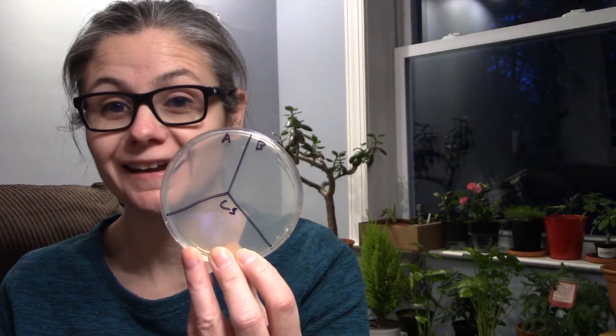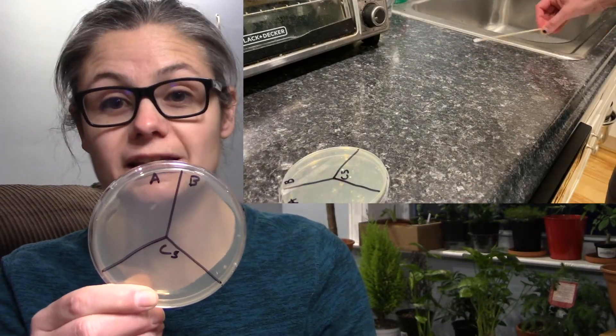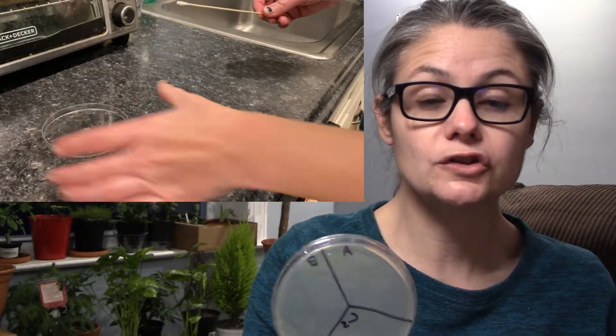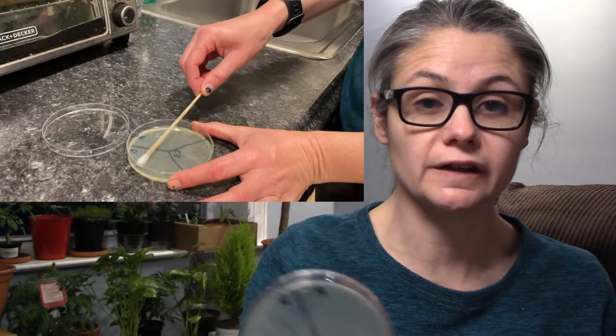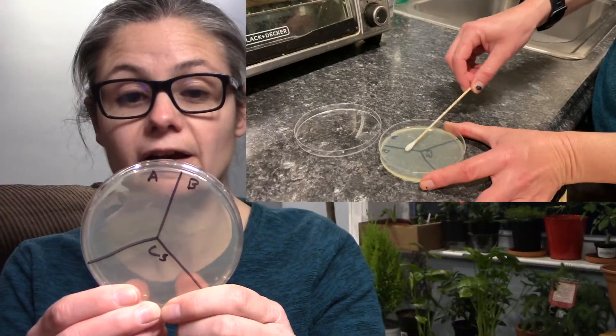Let me tell you how I go about testing how well a product disinfects. I take a Petri dish and label it A, B, and C. I take a sterile swab and swab the area I want to test, placing that sample on B for before. Then I disinfect the area according to the bottle instructions, swab again, and place it in A for after. Section C is my control — I won't put anything in Section C.